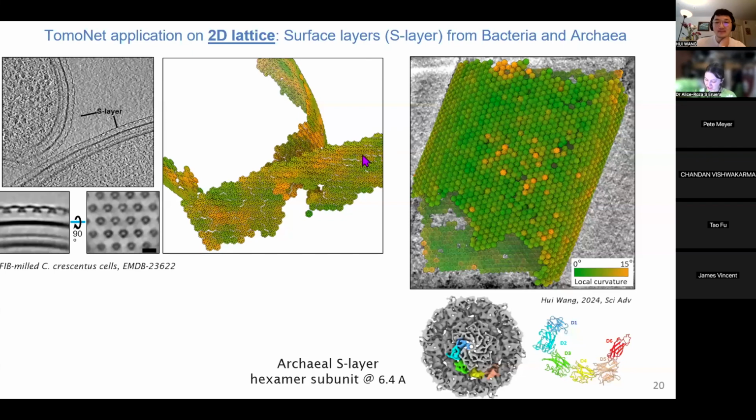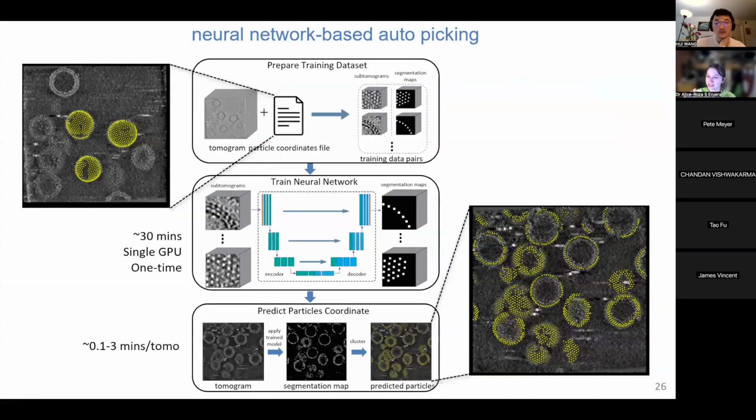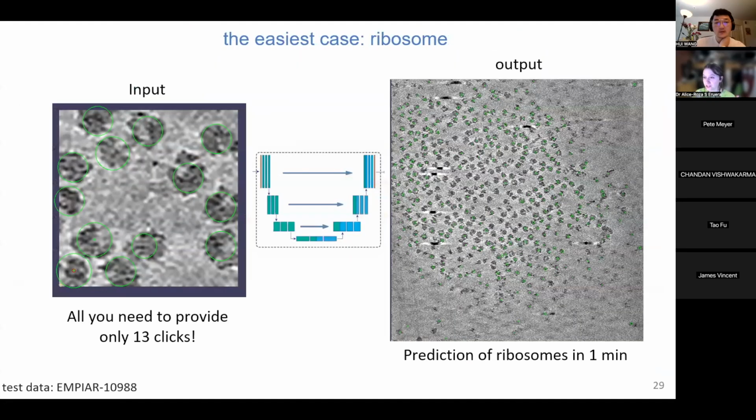And then I have another question about picking the training particles for the neural network based particle picking. How perfectly centered do your training particles need to be? Do they really need to be directly in the middle of the box in order for it to do a good job picking the rest? Or is there any flexibility if you're slightly off center? Because when you're picking by hand, sometimes, if you have a strange shaped particle and you're not looking at the right height. Okay. Yeah, okay.